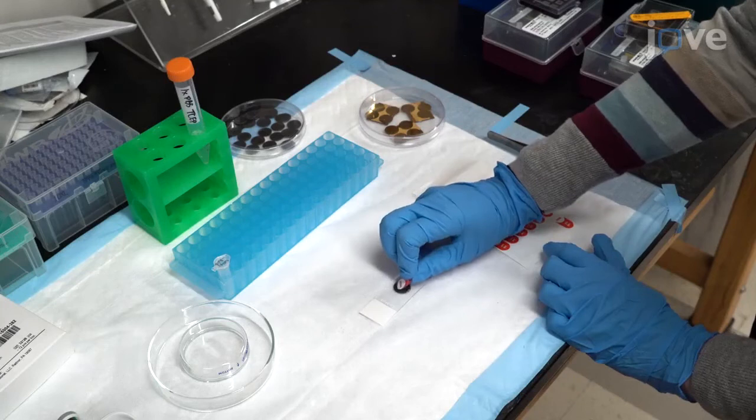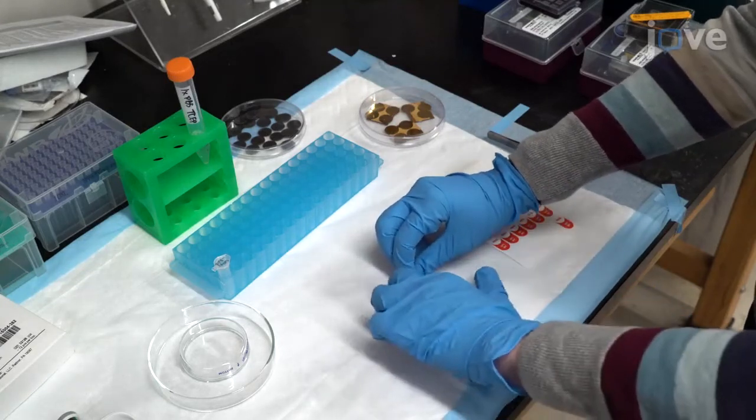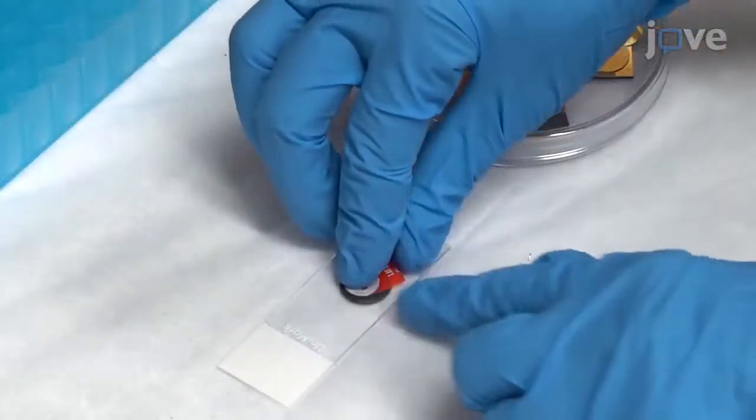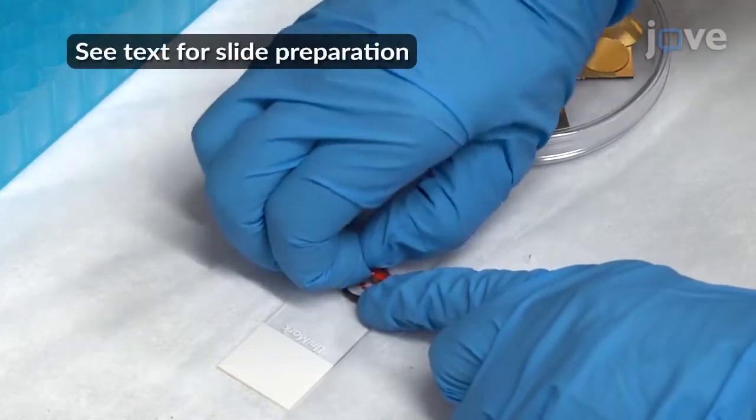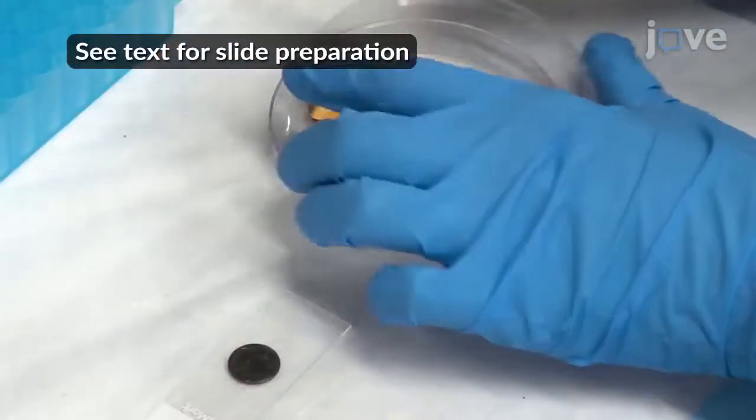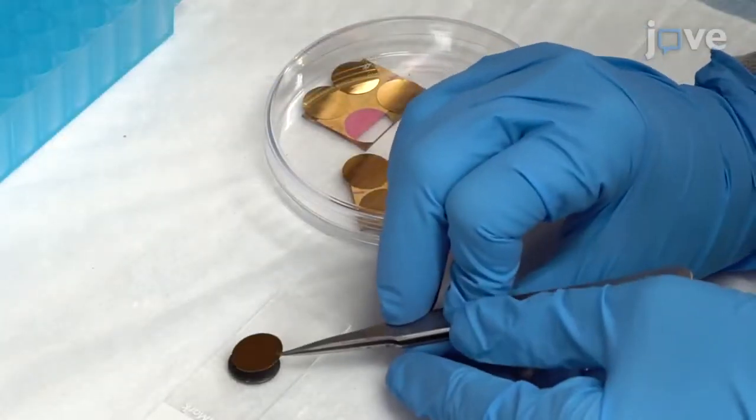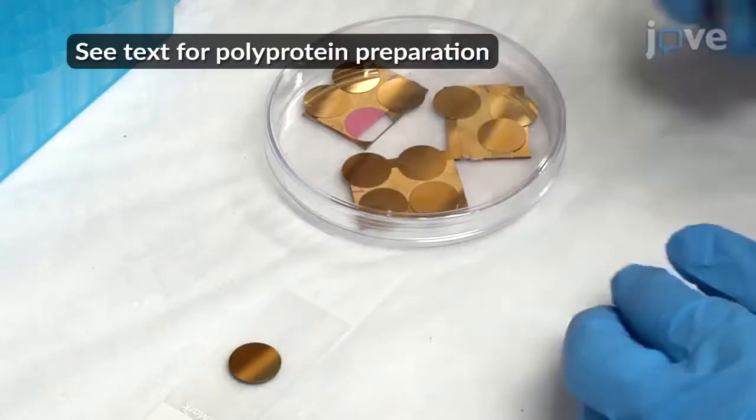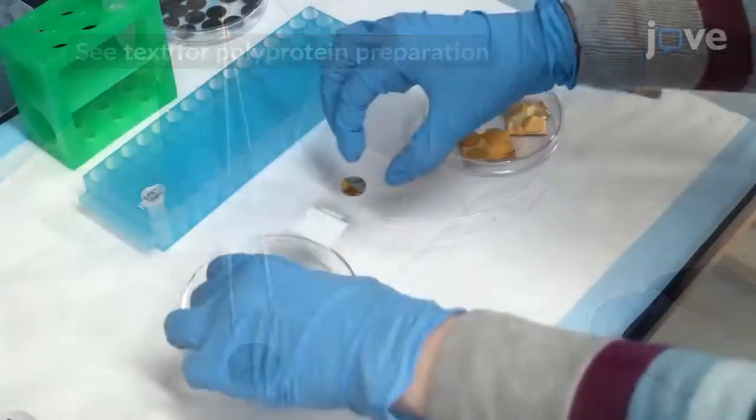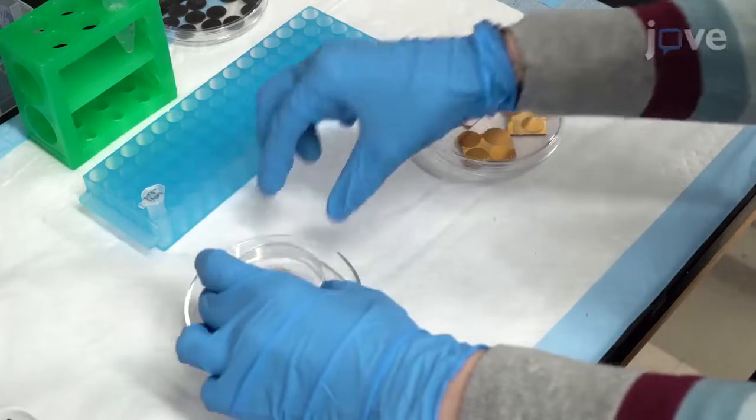To begin the procedure, attach a non-conductive adhesive tab to a clean 15 mm wide iron disc. Remove the cover sheet and firmly press a clean uncoated or gold-coated glass slide onto the exposed adhesive. Store the slide in a clean covered petri dish.